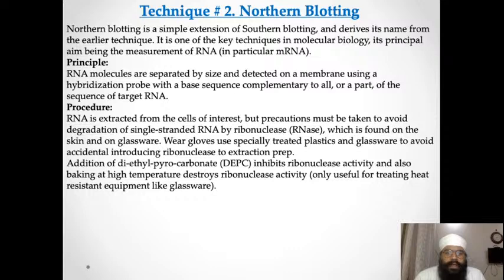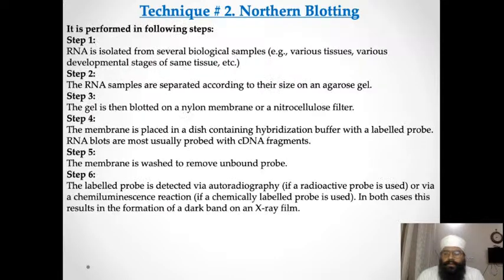So RNA is extracted from the cell of interest, but precautions must be taken to avoid degradation of single-stranded RNA by ribonuclease, which is found on the skin and on glassware. So here, specially treated plastics and glassware are used so as not to accidentally introduce ribonuclease to the extraction prep. Additionally, we add diethyl pyrocarbonate to inhibit ribonuclease activity, and also baking at high temperature destroys ribonuclease activity.